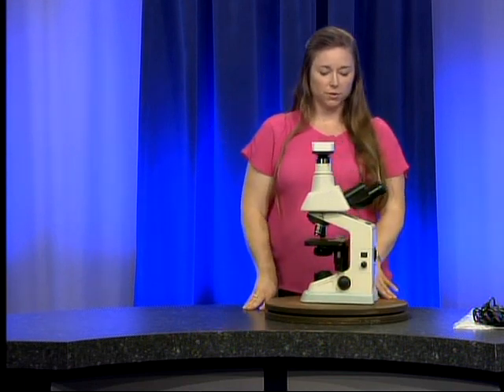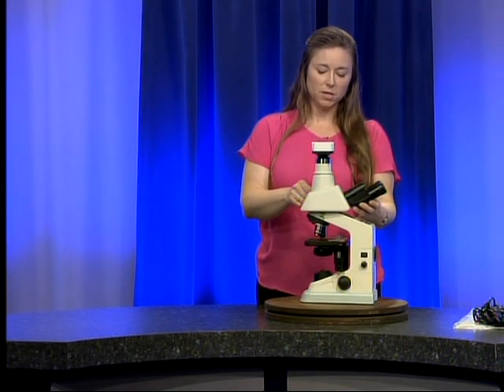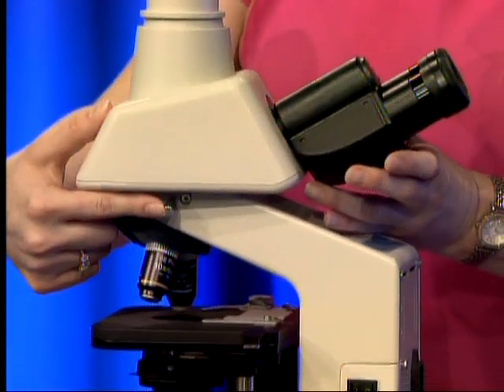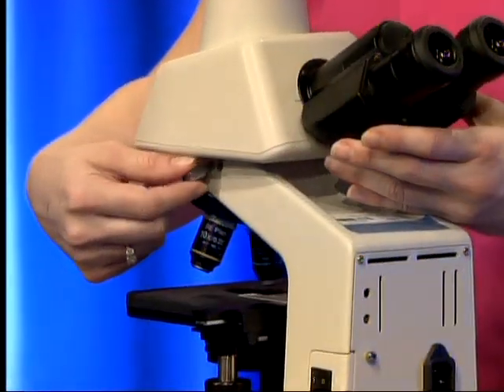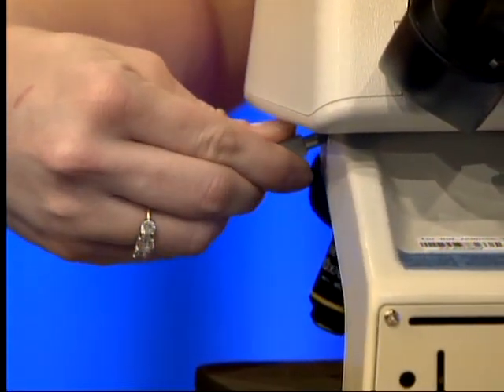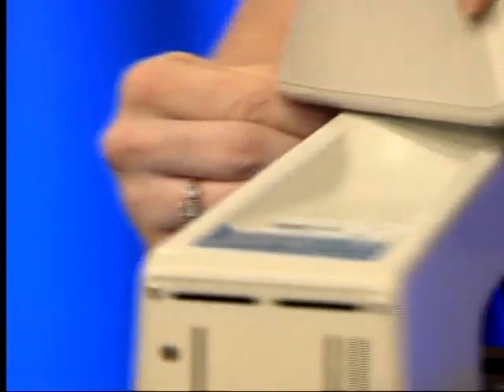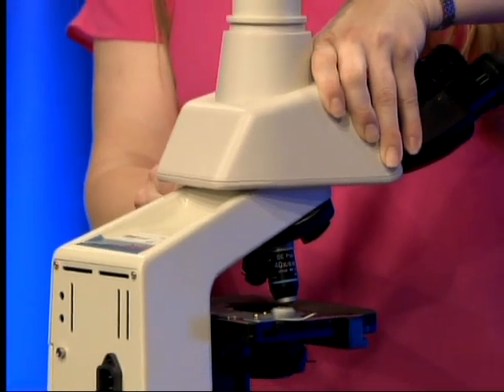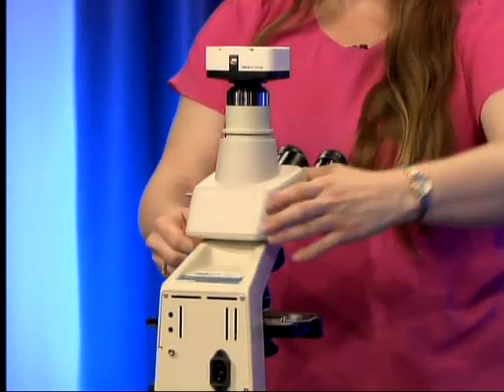Right now the oculars — the eyepieces — are turned around. This is the storage or transportation position. On the right side of the microscope you will see a little silver screw called the head clamp screw. I'm going to twist this about a half to one whole turn — any more than that and you risk the head falling off, and we definitely don't want that to happen. I've twisted that very carefully while keeping my hand on the head, and now I'm going to tighten it up. Remember: lefty loosey, righty tighty.